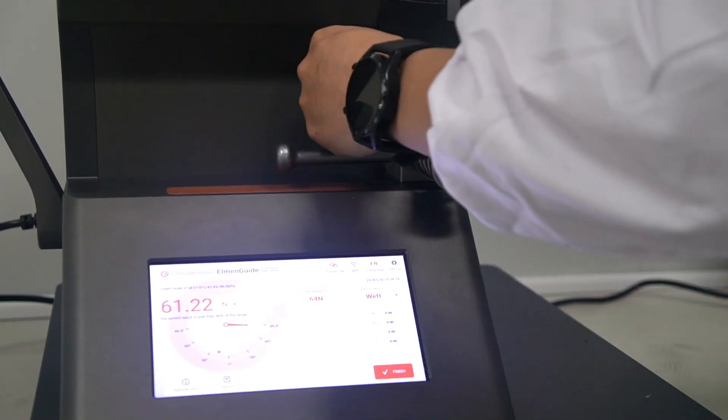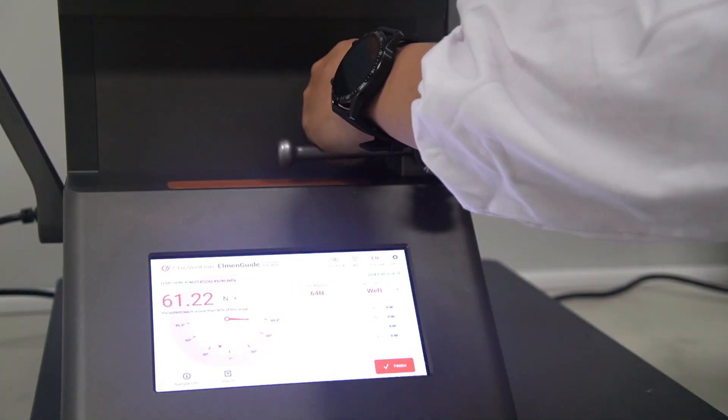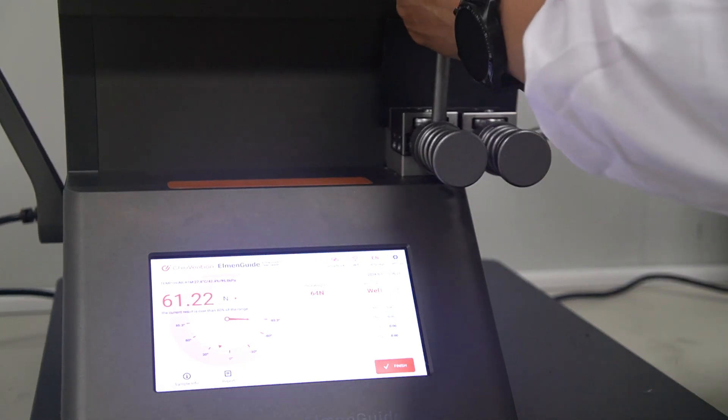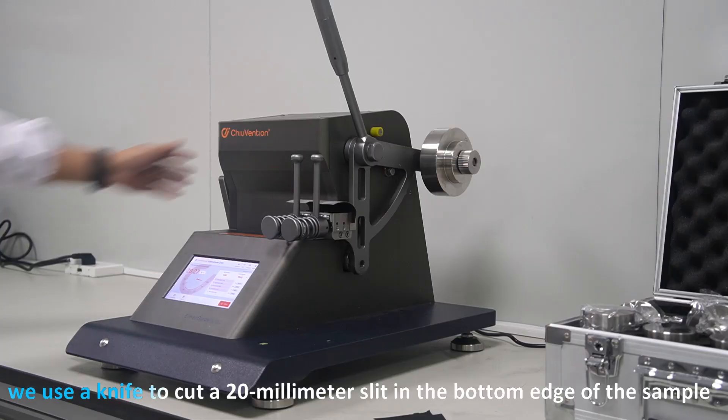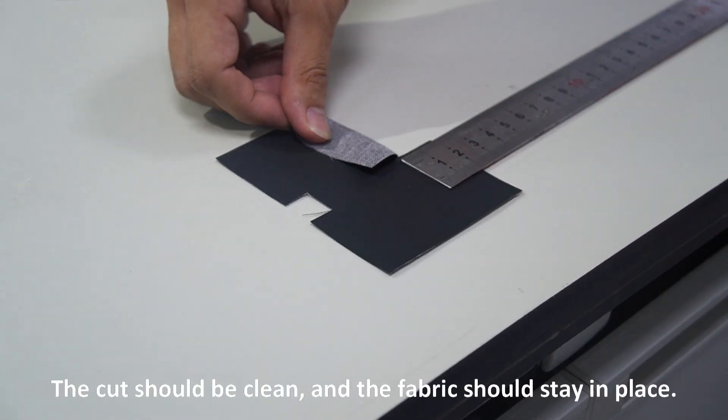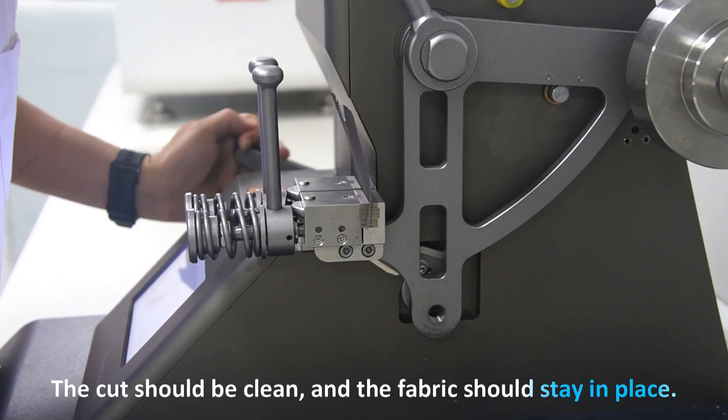Then we place the first specimen in the clamps of the tester, making sure the long edge touches the bottom step of the static clamps. Next, we use a knife to cut a 20 mm slit in the bottom edge of the sample. The cut should be clean and the fabric should stay in place.